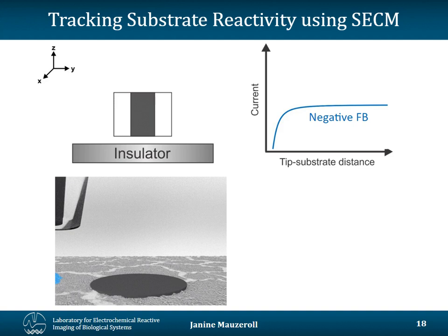And that we call true negative feedback, where the response is really governed by hindered diffusion and physical presence of the substrate.